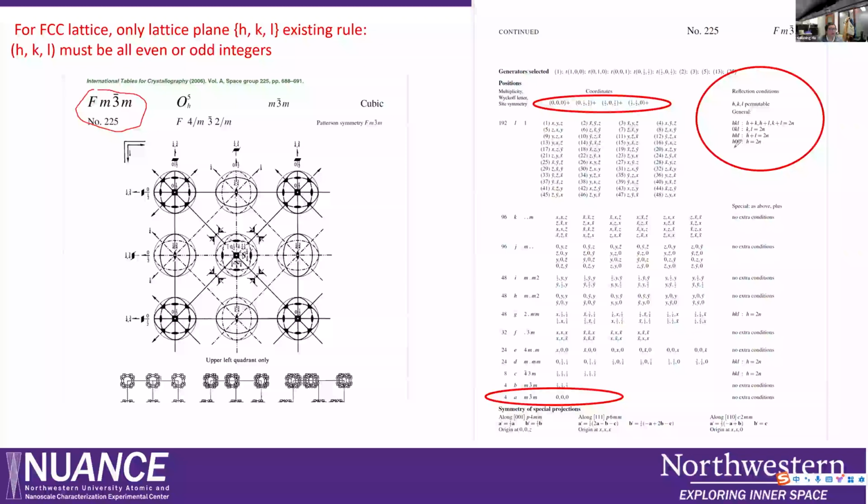If you check the reflection conditions, you will find this is the same as I showed you: HKL must be all even or all odd.